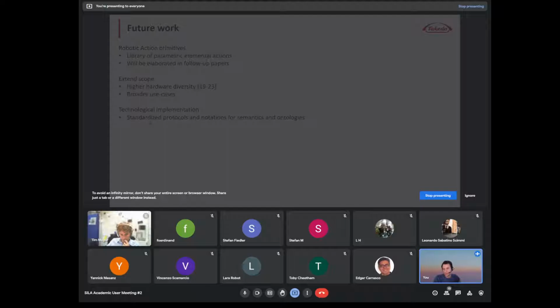As I said, the most important aspect in regards to the technological implementation is that we use standardized solutions, and that's why SiLA is one of the most important enabler technologies from our point of view.